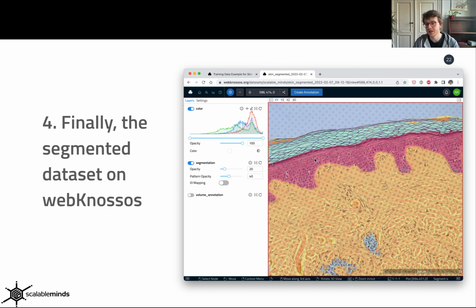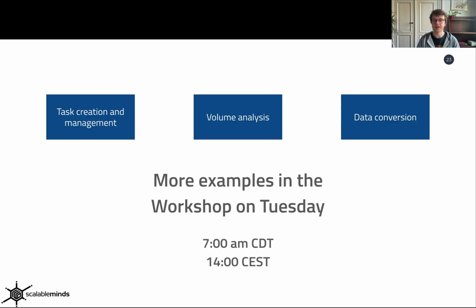And now we can share this with our colleagues, or we can also use the annotation features to do some touch-ups. So here would be something that we want to fix here as well, and these probably as well. And after doing these touch-ups, we can then download the data, or we can share them again, or use it in any kind of way that you want. So this was just a short example of what you can do.